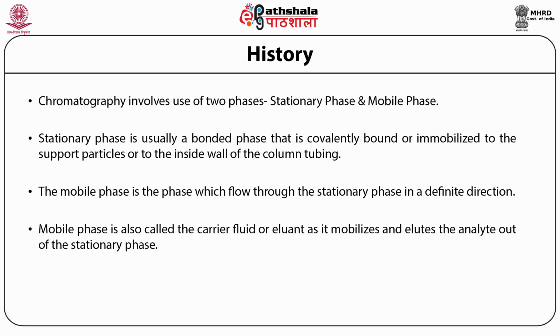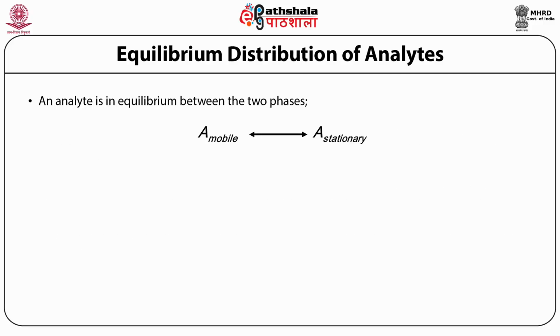The equilibrium between the free and adsorbed states depends on the following factors: the polarity and size of the molecule, polarity of the stationary phase, and polarity of the solvent. The size, shape, and polarity of molecules is their characteristic feature and is determined by their own chemical structures. This equilibrium can be changed by selecting different stationary and mobile phase combinations.